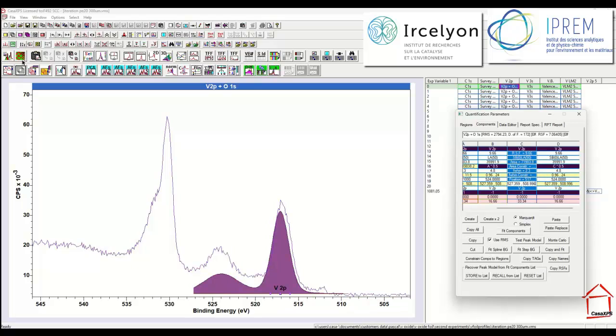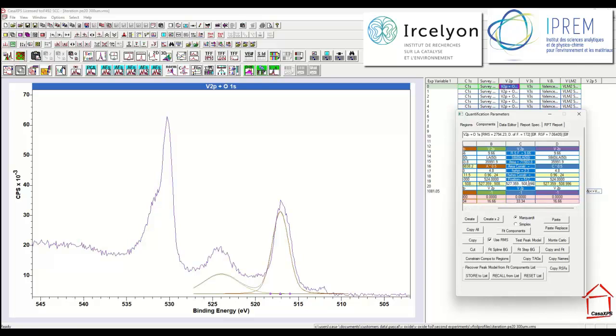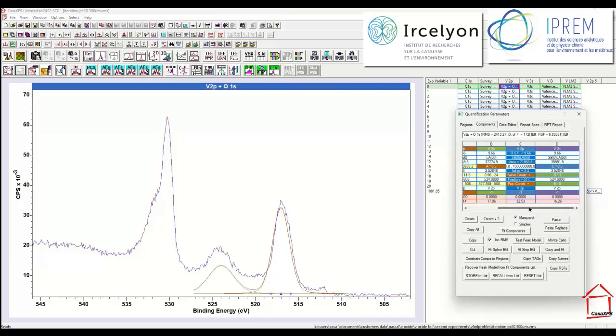And I just want to introduce some additional constraints, such as I would like each one of these backgrounds to position themselves beneath the two component peaks. I would also like the backgrounds to have the same full width half maximum parameter as the two component peaks. So these are relational constraints between these bell-shaped curves and S-shaped curves that ultimately will fit these data.